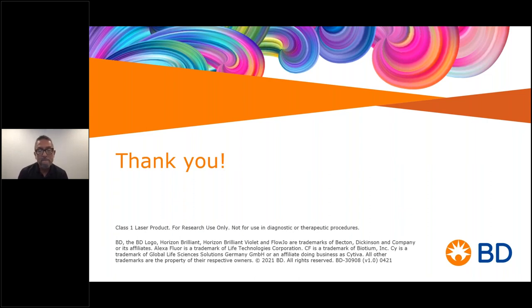Yes, absolutely. Again, we have 2 minutes, so I'm going to try to be quick before they cut us off. Actually, this is a beautiful example in which SSM and TSM would be working together to ensure that quality control. The beauty of this is, from the same set of controls in FlowJo, you can create SSM, which will be your quality control for your instrument, right? And then you will have TSM that will tell you about the biology.